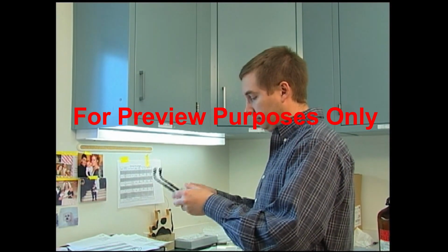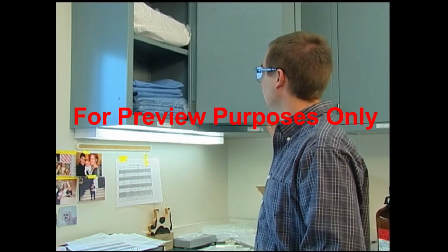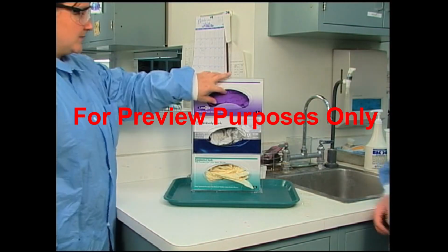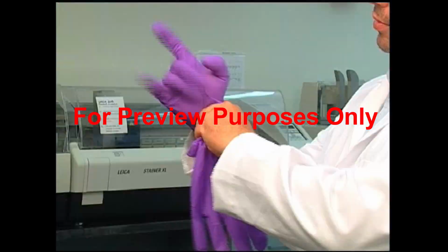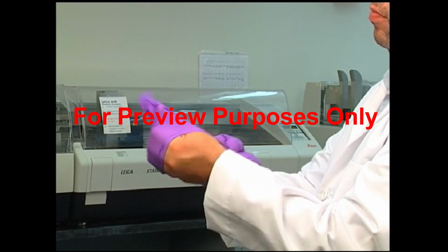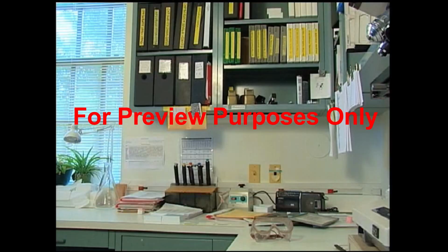The most basic way of shielding yourself from hazardous levels of exposure to formaldehyde is through personal protective equipment. Gloves are a good place to start. Protective gloves are often designed to be used with specific substances or hazards. When you're working with formaldehyde, OSHA requires you to choose gloves that are impervious to solutions of 1% or more.